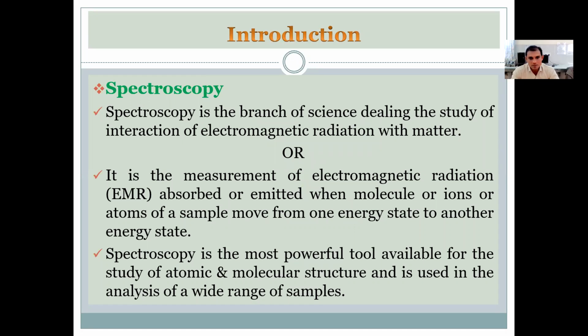Then they will emit electromagnetic radiations, or absorb electromagnetic radiations. Spectroscopy is the most powerful tool available for the study of atomic and molecular structures. It is used in the analysis of a wide range of samples.